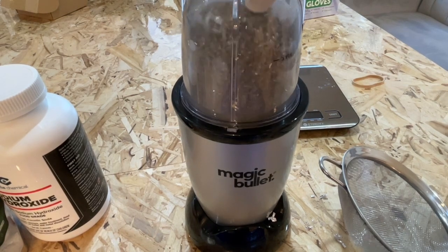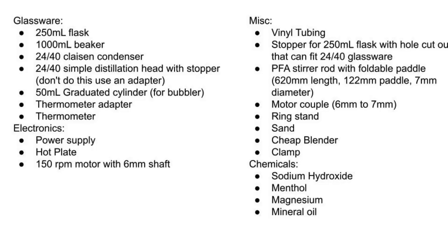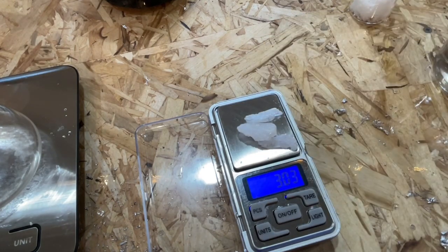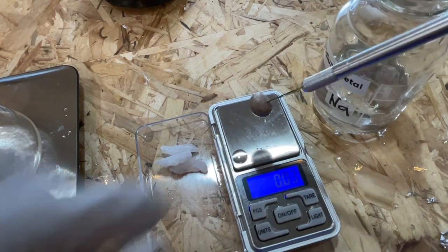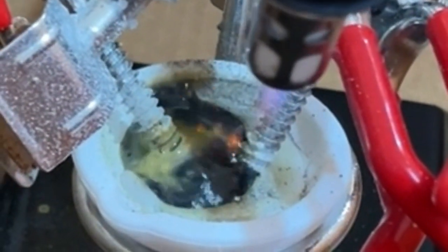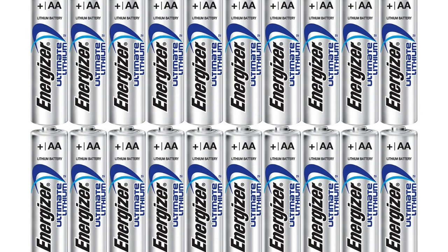Once these initial steps were undertaken, I was ready to begin the full experiment. For this experiment, I measured out 20 grams of the dried sodium hydroxide, 3.03 grams of menthol crystals, and approximately half a gram of sodium from an earlier run. This sodium can also be obtained using the Kastner process. I didn't particularly like that method because it made my skin and lungs feel spicy from all the lye dust generated. Lithium metal from a lithium battery can also be used in its place — that is what I used on my first run.